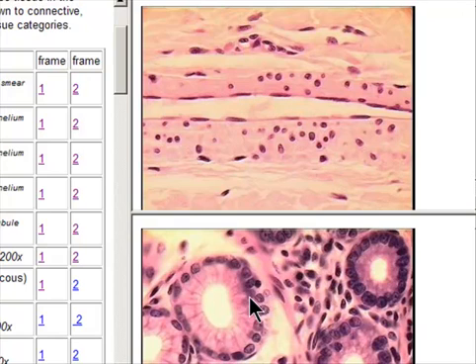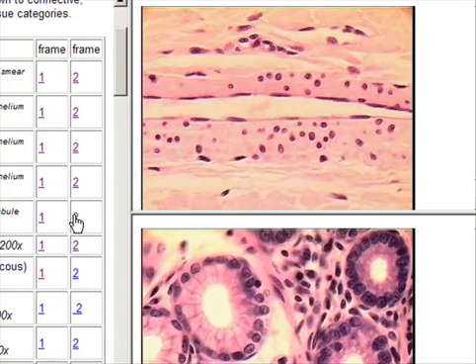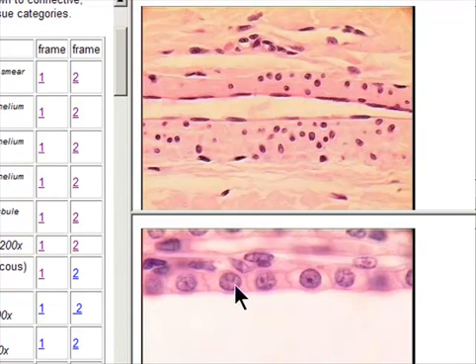This shows you columnar epithelium. And again, look how different it is from cuboidal. This is the basement membrane. And here the cells are taller than they are broader. So you can see a lot more cytoplasm above the nucleus. So, if you were asked a question on how to give two relevant features for identifying it as cuboidal, you would say that the cells are as tall as they are broad, and the nucleus is in the center of the cell. So just to show you that this was the image that was taken. So you can see how the nucleus is in the center of the cell.